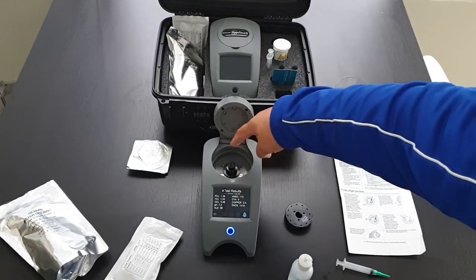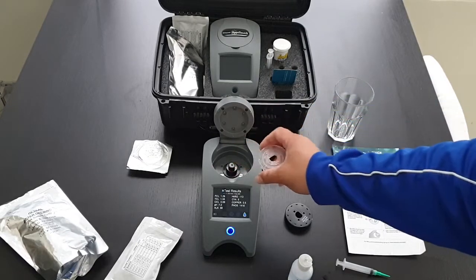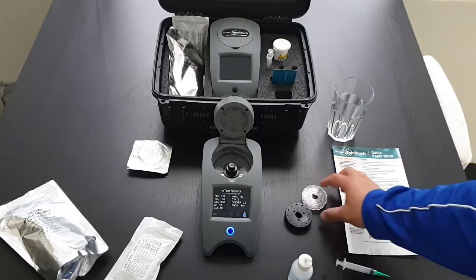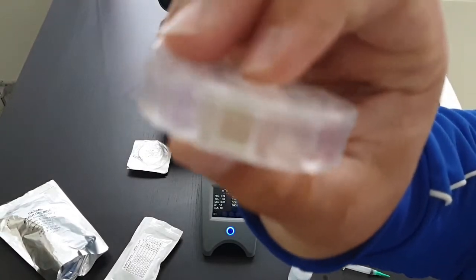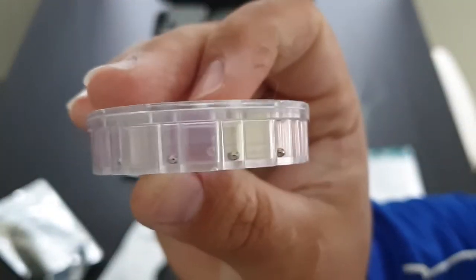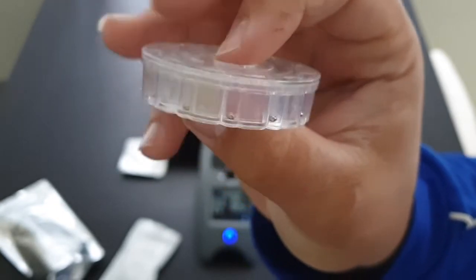This is a photon meter — light shines from the top through to the sensors. The chambers will change colour, and one chamber is for each different test.